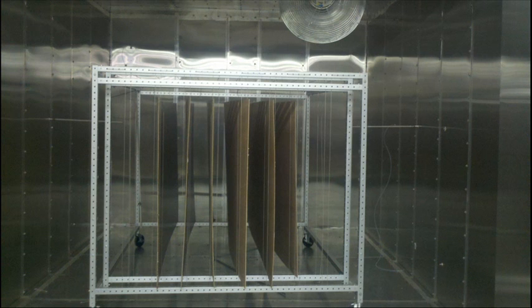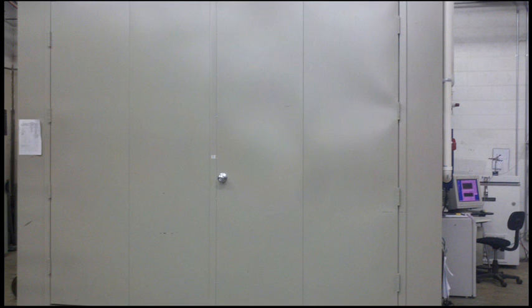The test chamber is kept at steady temperature and humidity conditions of 77 degrees Fahrenheit and 50% relative humidity.